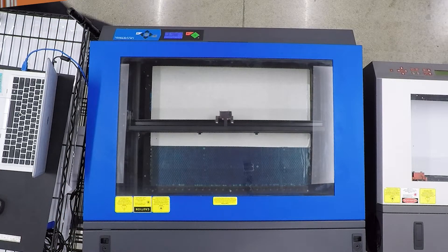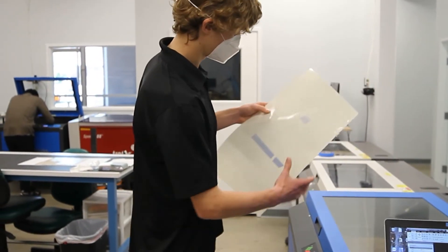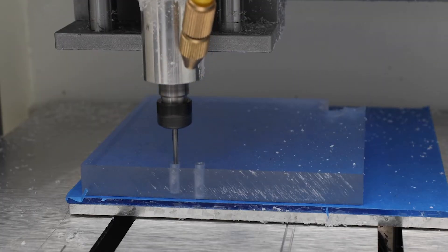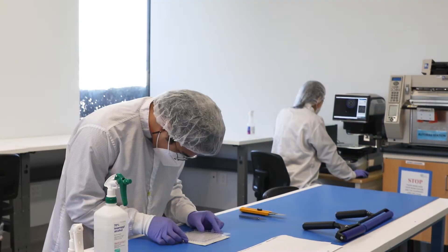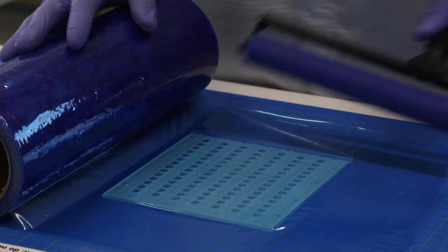We're able to take a design and slice it into its sub-layers that then get produced using a combination of laser cutting, die cutting, and CNC milling. We also have a fabrication team that's highly skilled in assembling these layers together in a clean room environment, producing all the internal and external features.